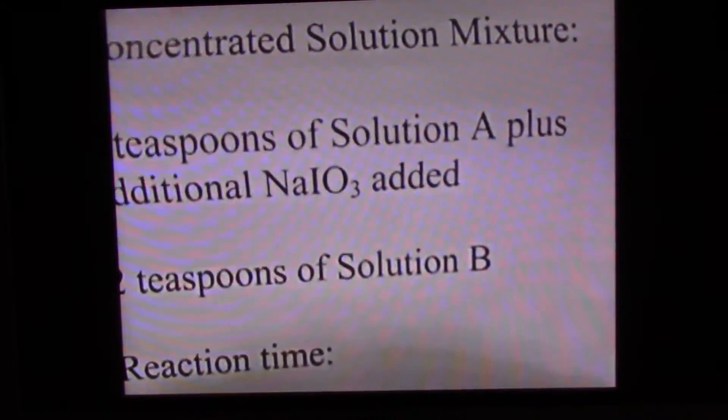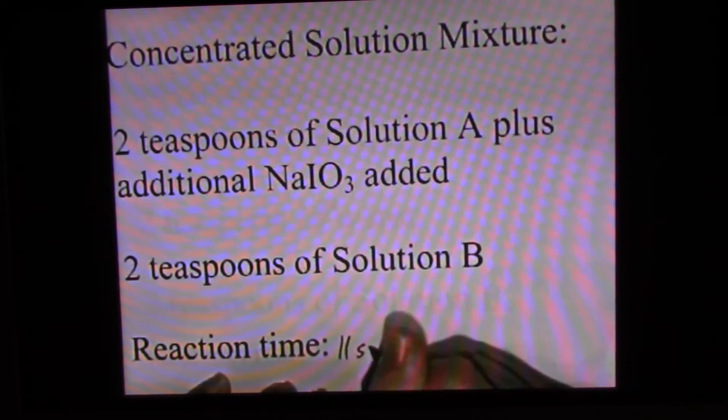Solution A is more concentrated — it has more iodate per volume. We've added solution B and hit the timer. Will it take less than 23 seconds or more than 23 seconds? If it's less, the reaction occurs more quickly. There we go — eleven seconds. So the reaction is faster when solution A is more concentrated. Reaction time recorded: 11 seconds.